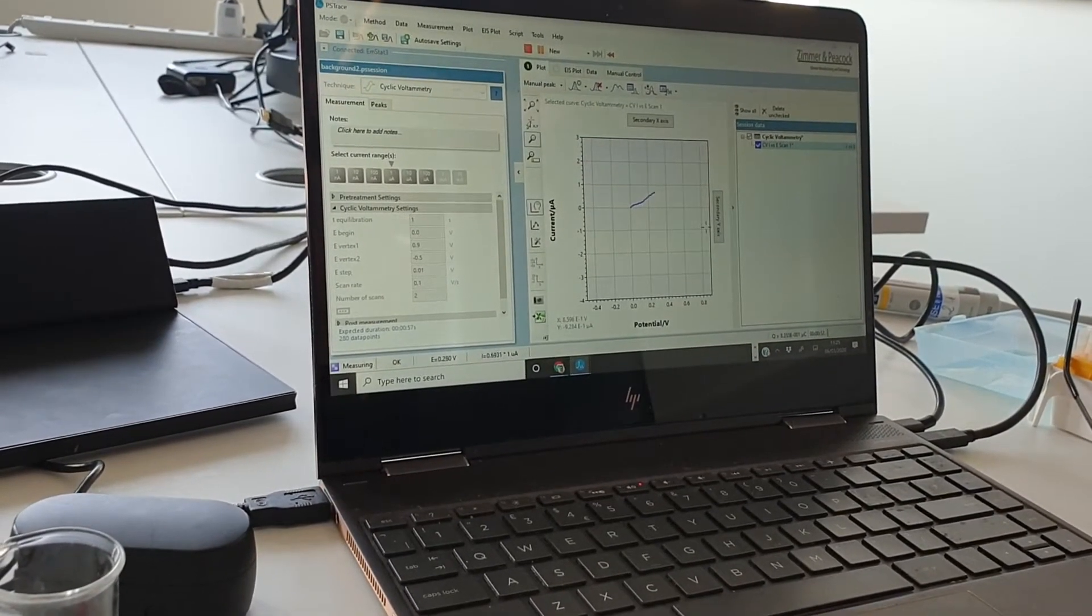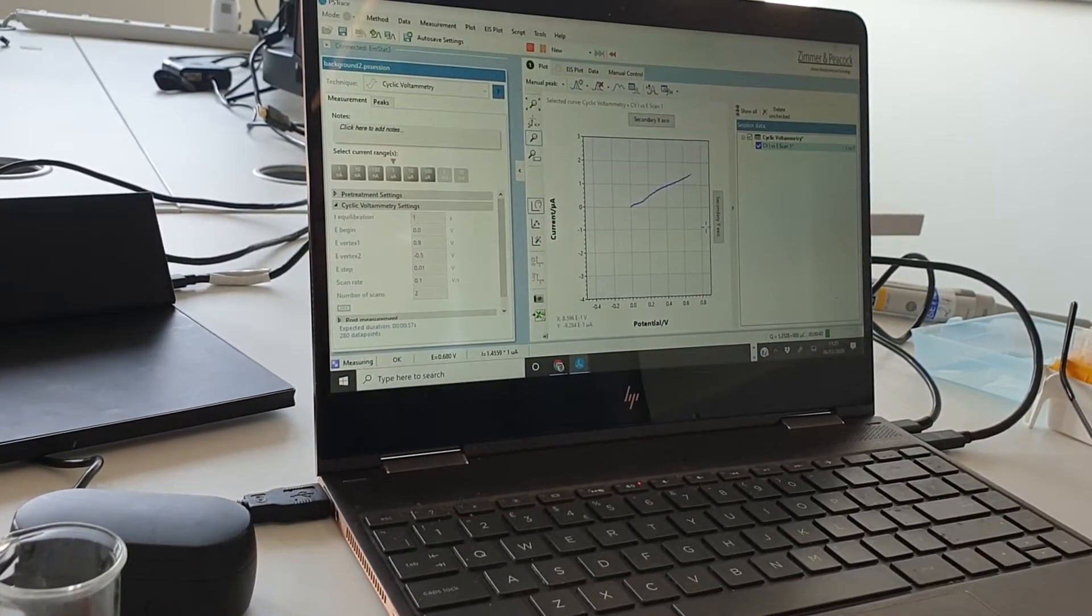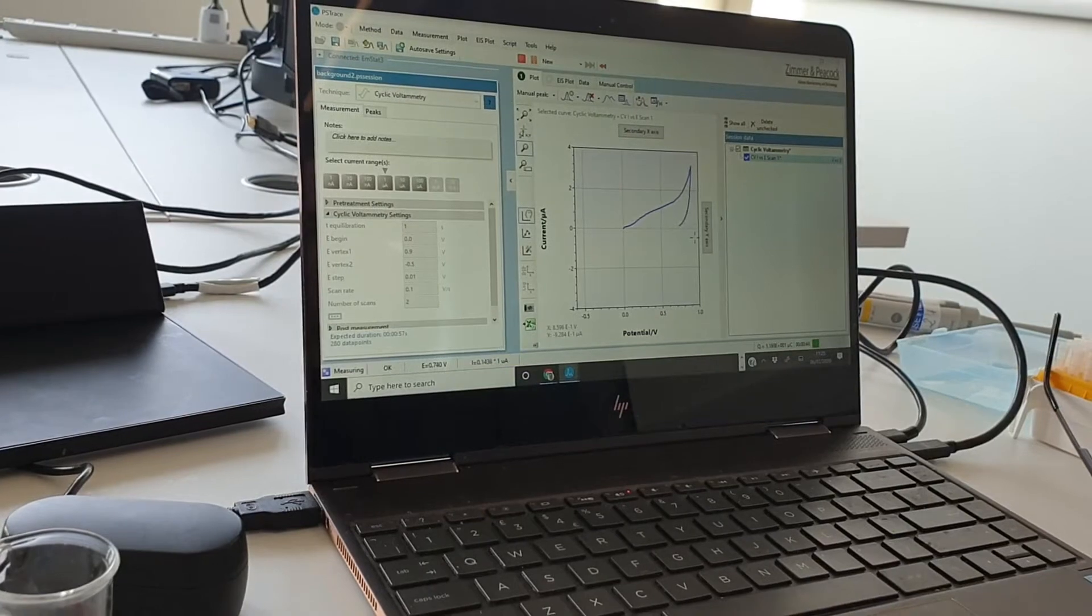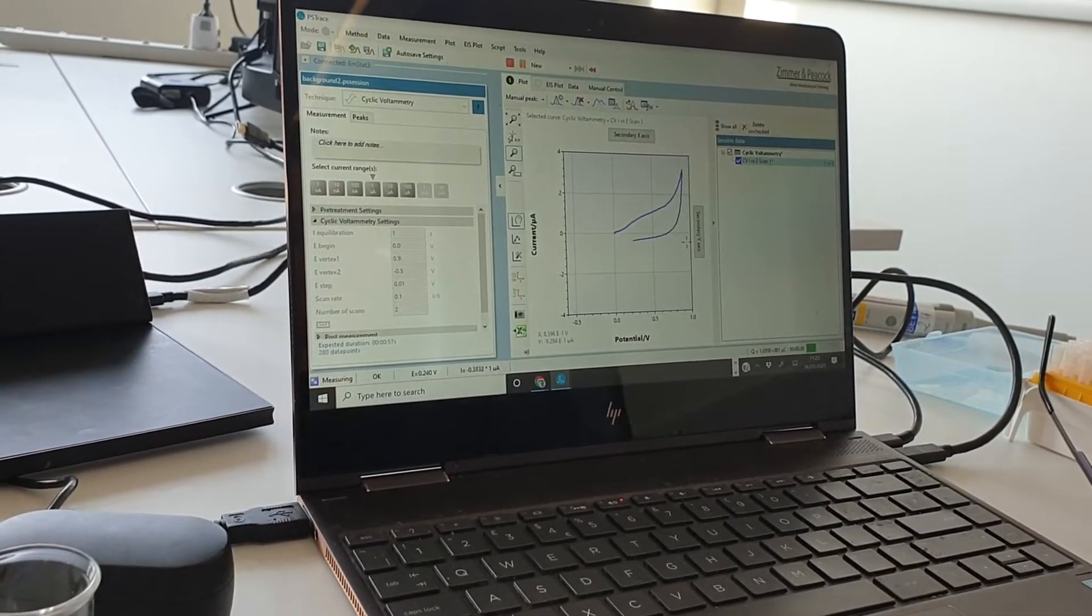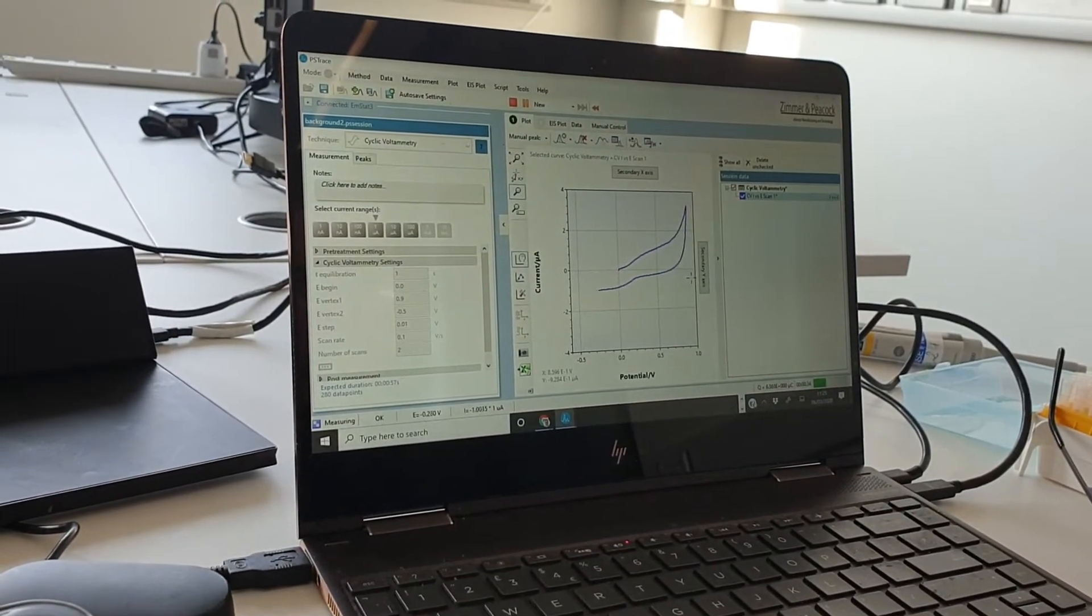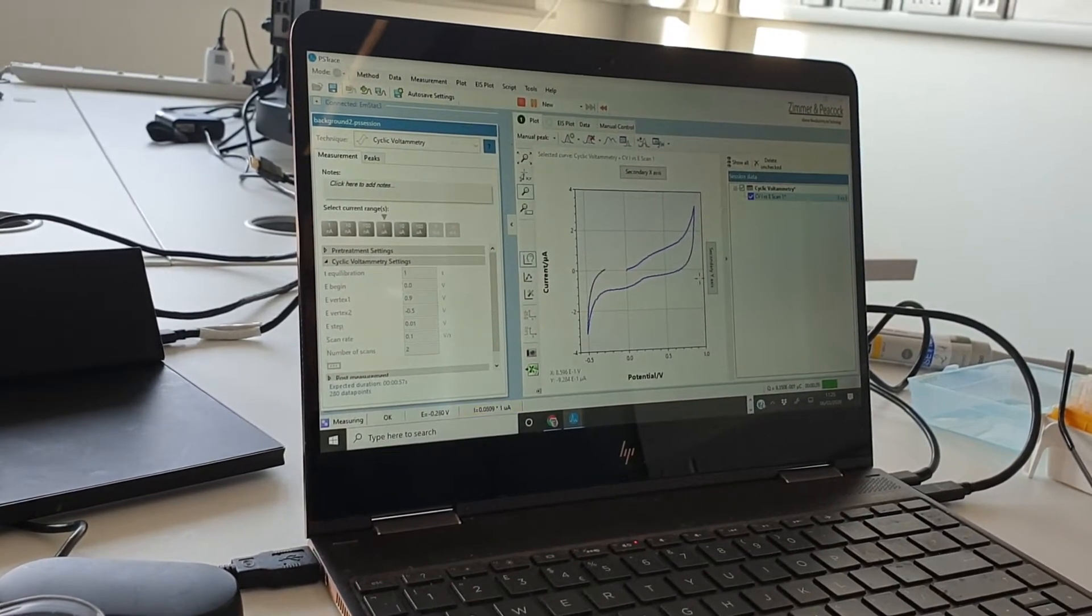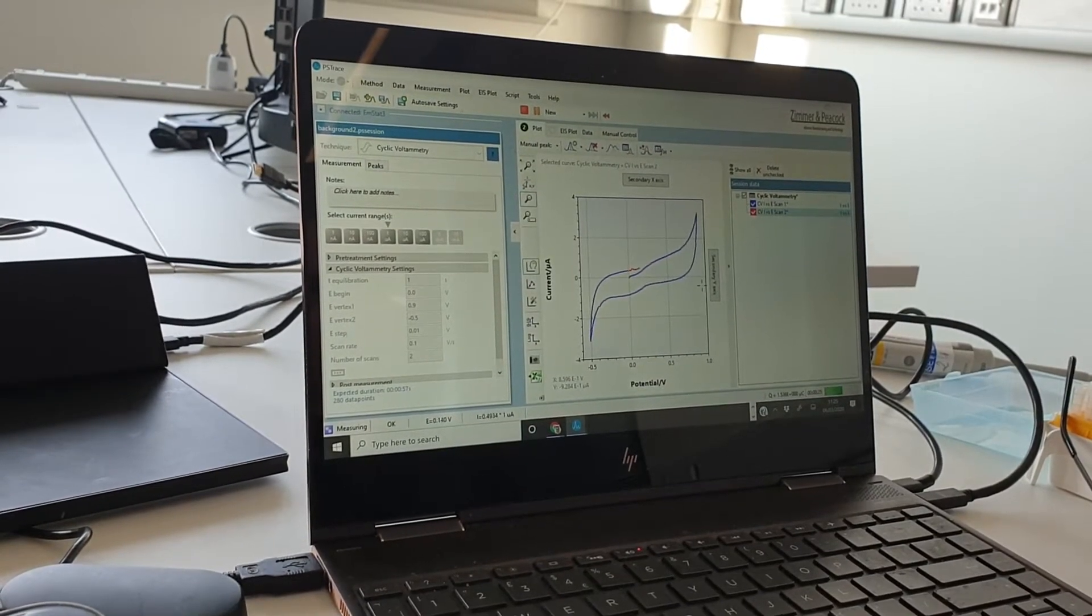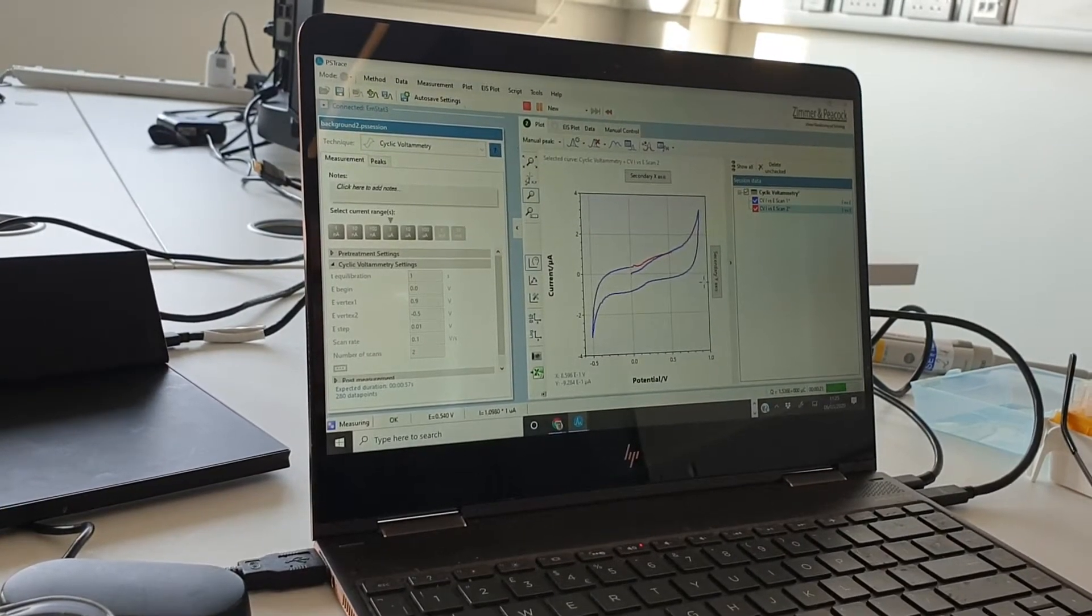And so we're just getting the background buffer signal there. So that's the kind of hydrolysis of water at the end there, and then it's going to come down and we'll start getting the reduction of oxygen round about there. And then we're coming back again. And the way we set the software up it will do two scans, so scan number two is coming now. So we'll let this complete.